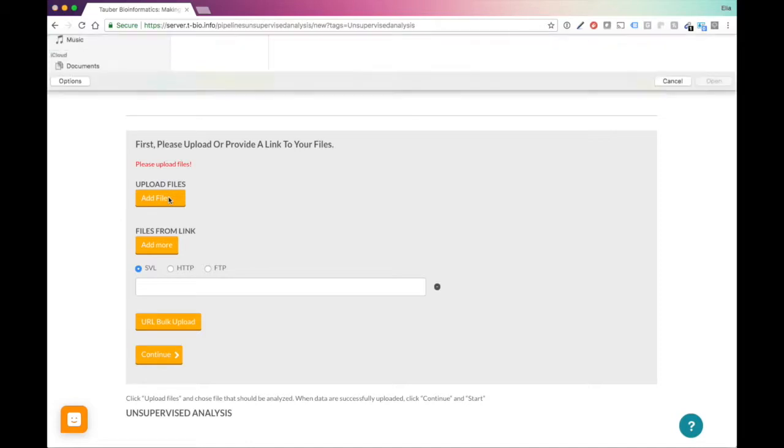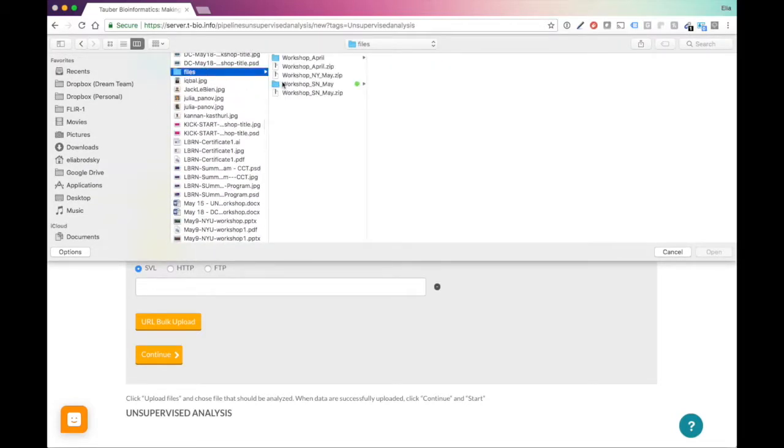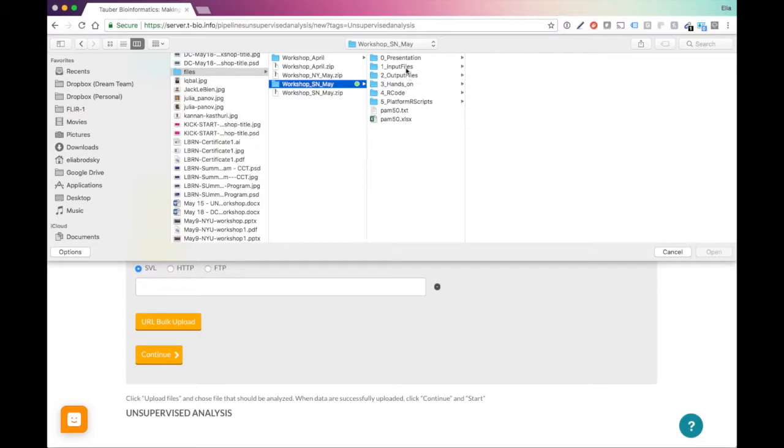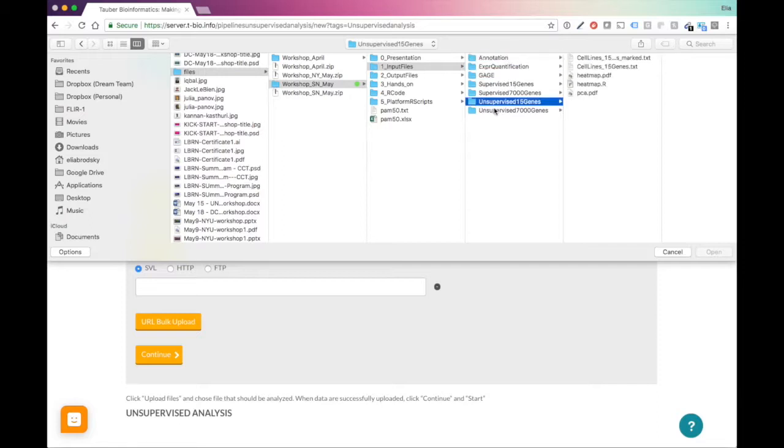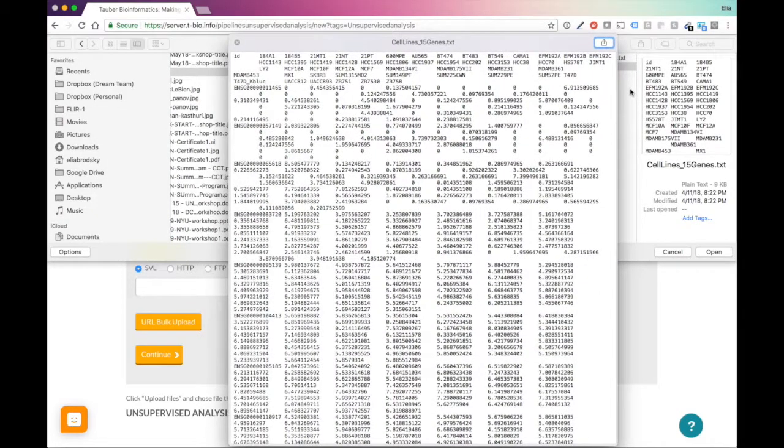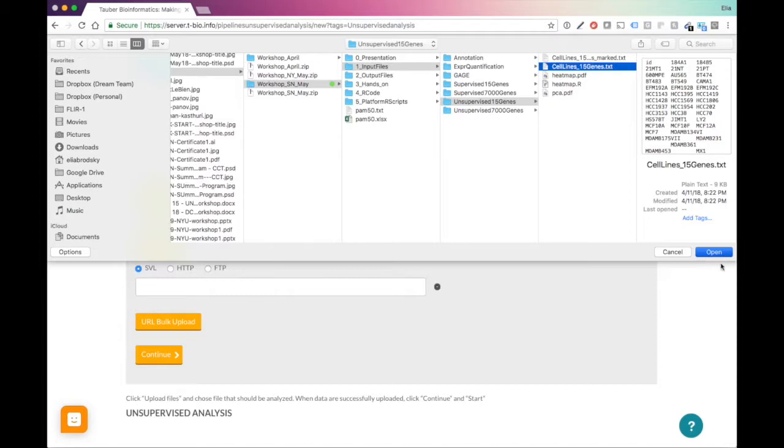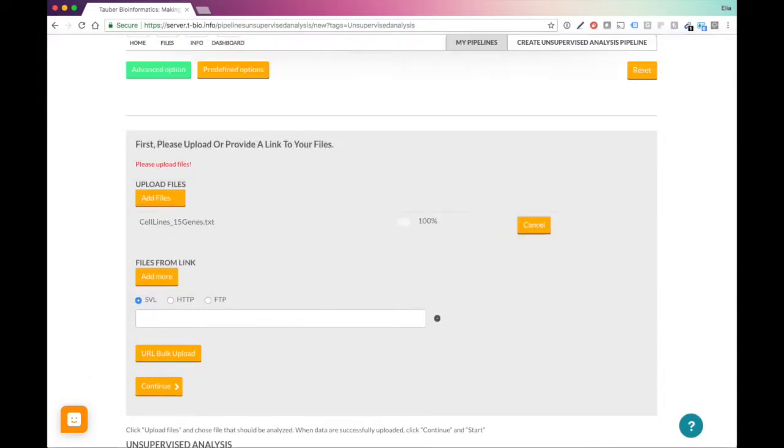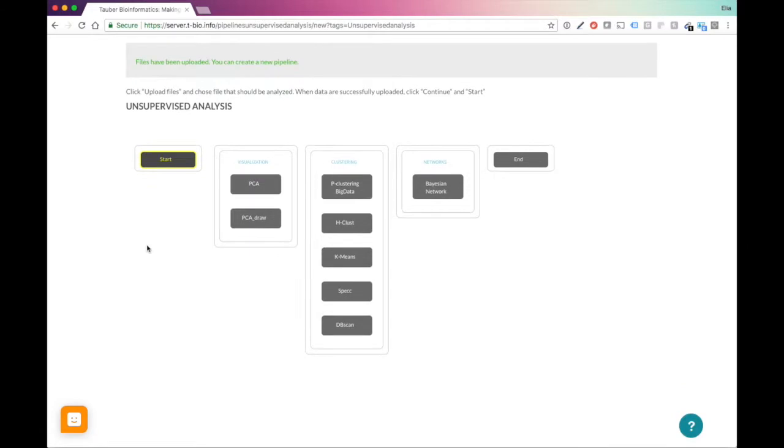Let's go ahead and add some files. What I'll do is I will take some files that I have. You might have different files. Let's do unsupervised. We have these genes right here. Let's just take a look that we've got the right table. We've got some samples here, a bunch of GeneIDs. Now we've got continue, start.